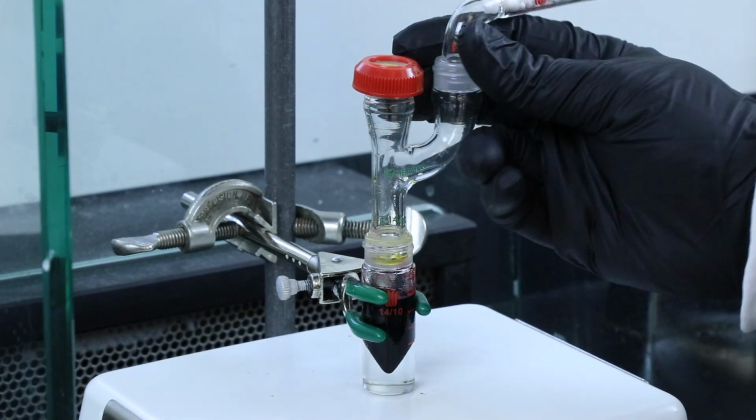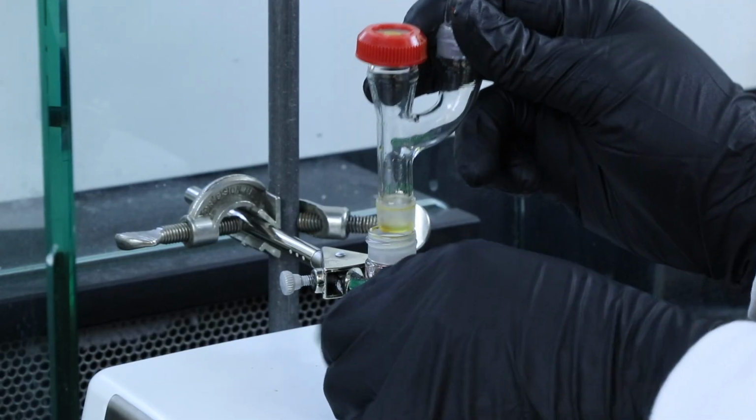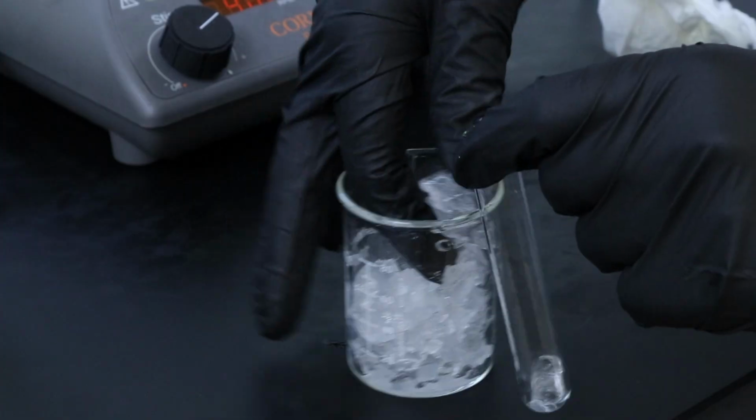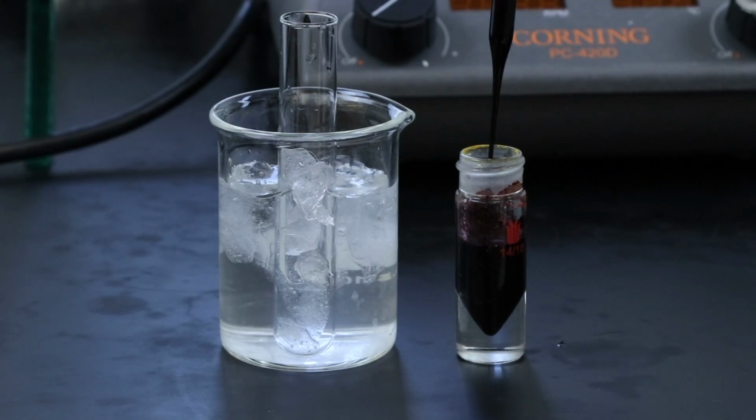Once that time has passed, I'll remove the drying tube and the Claisen head adapter and start preparing the test tube with ice so that we can quench the reaction. I'll fill it about 2/3 the way up with ice and then begin transferring the solution over.